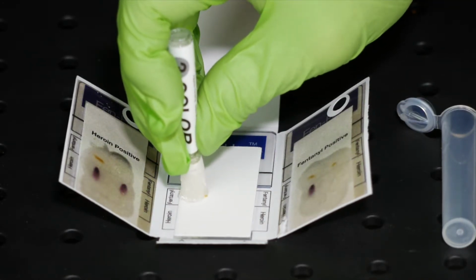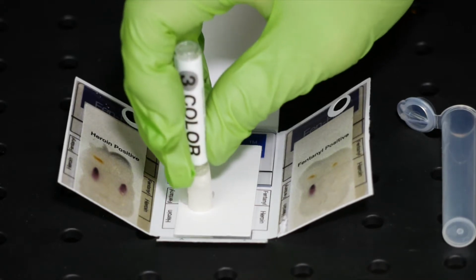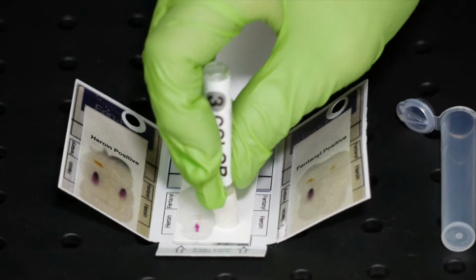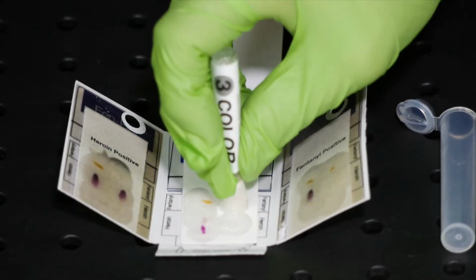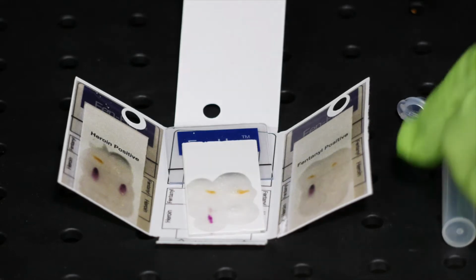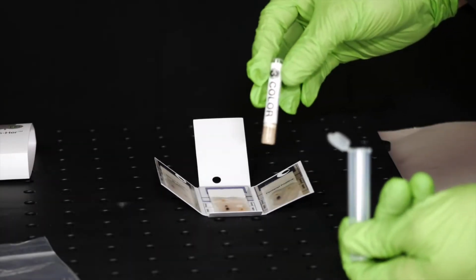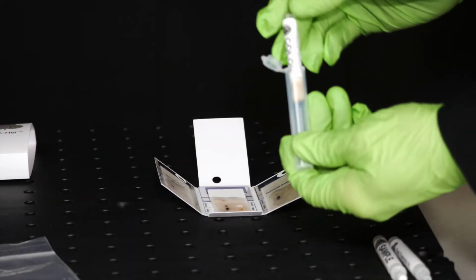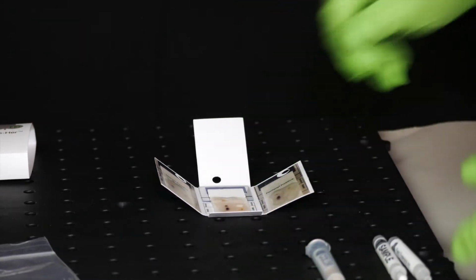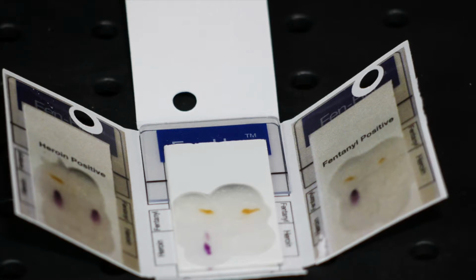Dab and squeeze the wet color swab onto the plate in the pattern seen here. Caution: the acidic liquid is now on the surface of the plate. After wetting the plate, return the color pen to its container and seal the top. The color will appear in 30 seconds or less.